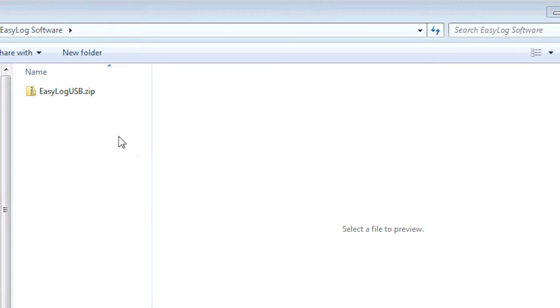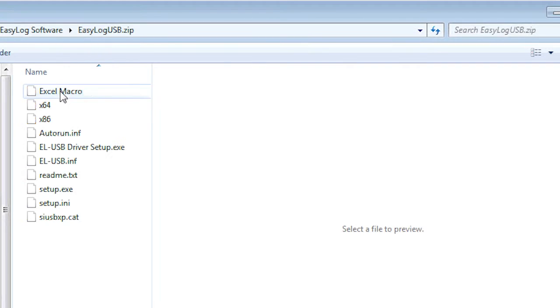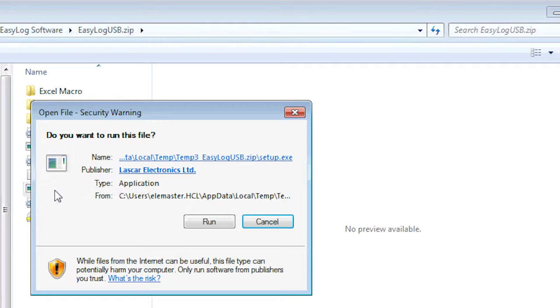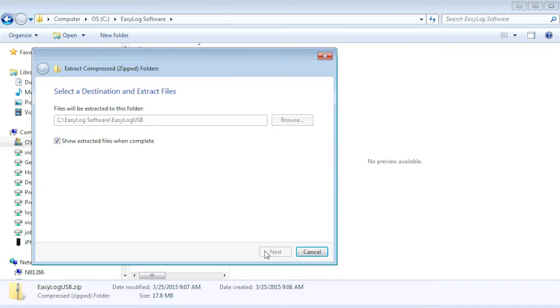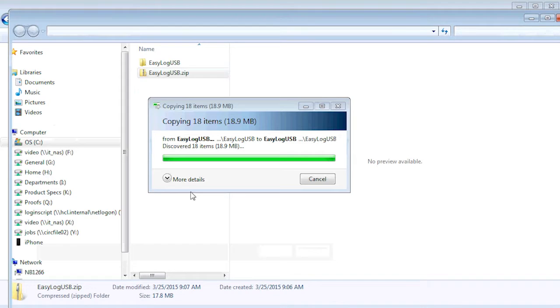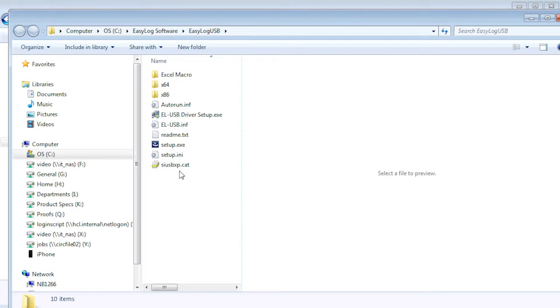When the download is complete, go to the location where you saved the zip file. Open the zip file and select setup.exe to begin the installation. To avoid any possible installation issues, I am going to extract the contents of the zip file to a new folder and run setup.exe from there.